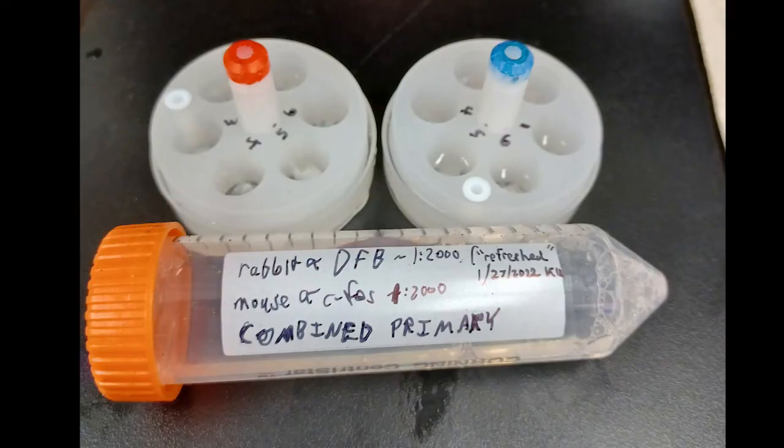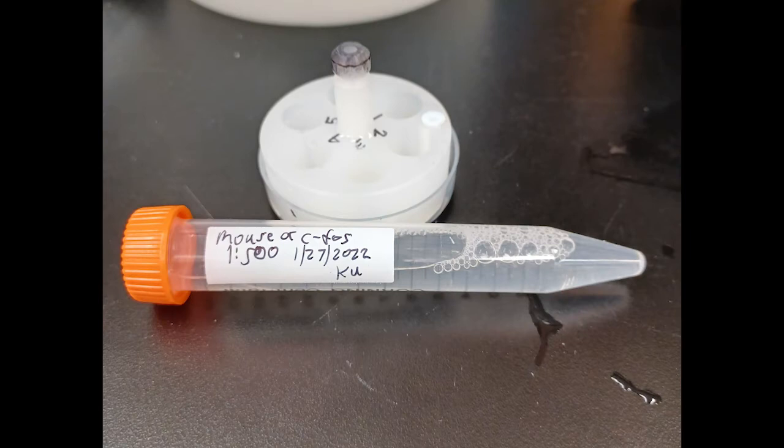On the counter, there are two tubes that the primary antibody solutions are normally stored in. Primary antibody solutions can be salvaged and reused, and they are also a somewhat expensive reagent. So, grab first this tube that says combined primary, and this other tube that says mouse anti-CFOS 1-500.